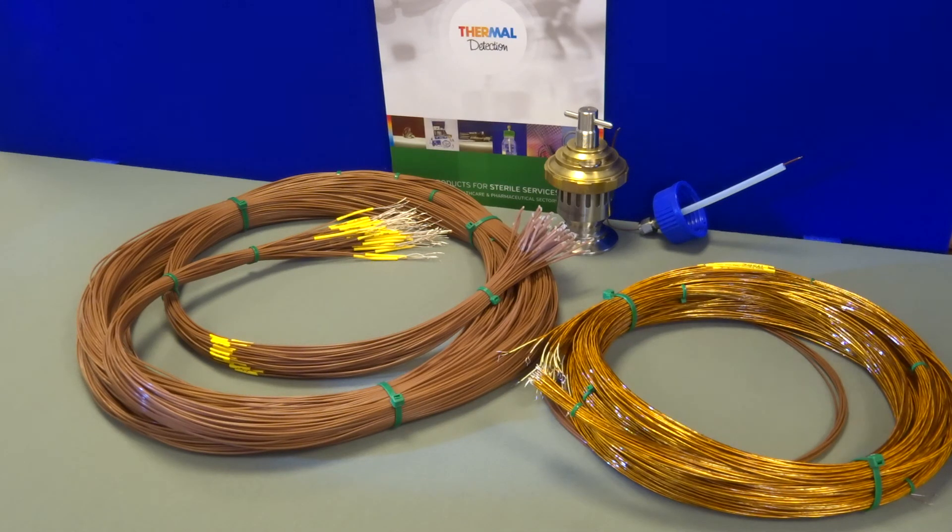This prevents twisting, kinking and knots in the cable, which saves valuable man hours for the engineer and of course unnecessary stress.